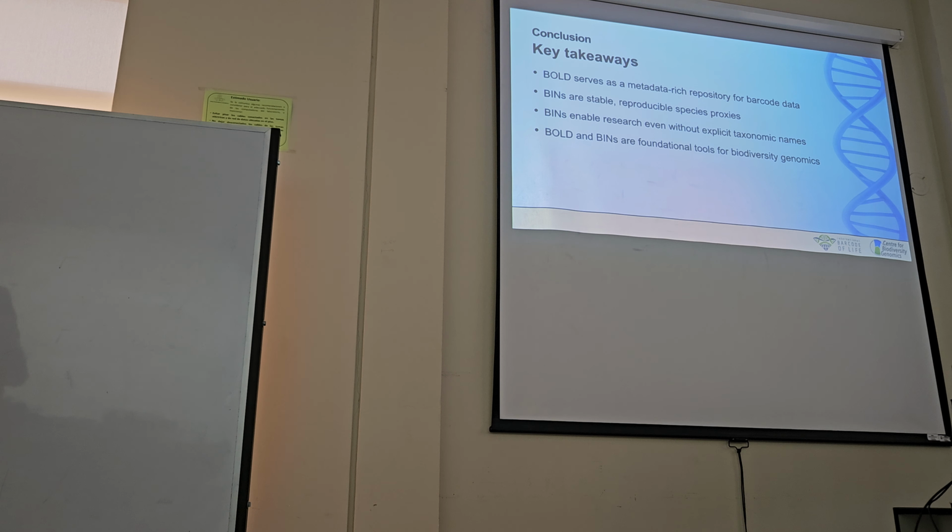It's less confident when there are multiple different matches. Say your barcode is equally similar to two genera, then that's low confidence, I would say. Confidence means all the records are in agreement that it's the same thing.